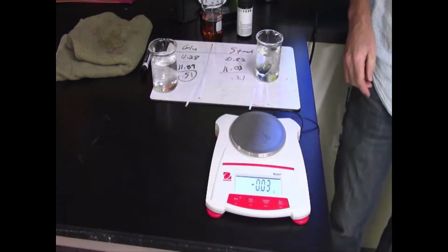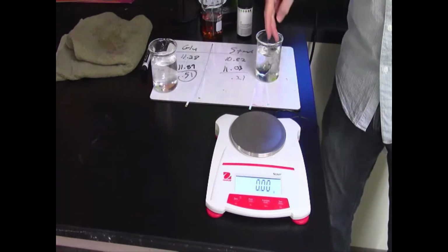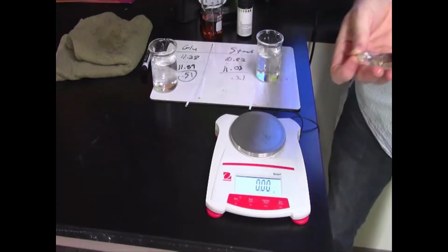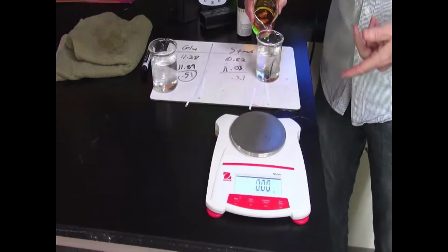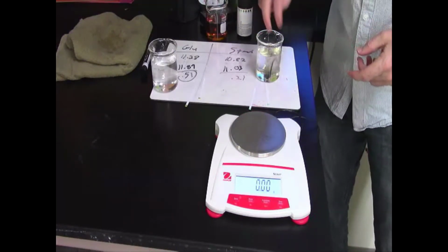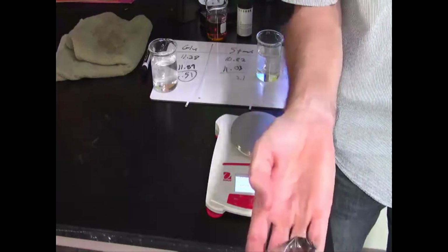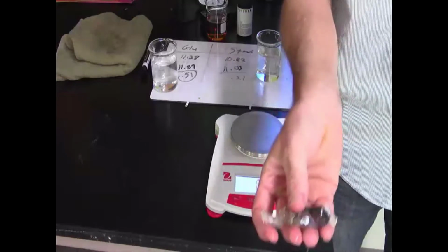And a lovely good morning to all you guys. So let's see what happened overnight. Look in the starch bag, and I can see it's all blue. So I put a little bit of the starch iodine solution outside of this, and evidently the iodine was able to leak through the holes in the membrane here and turn the starch inside the bag black.